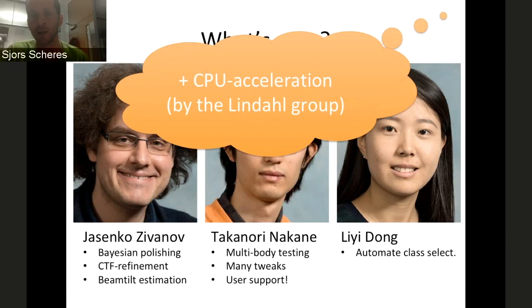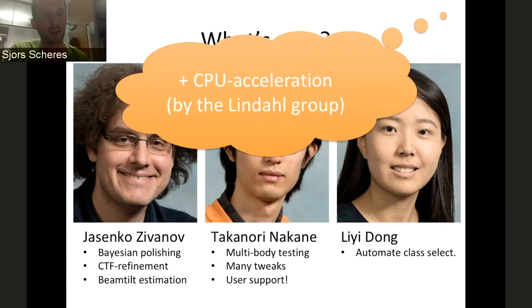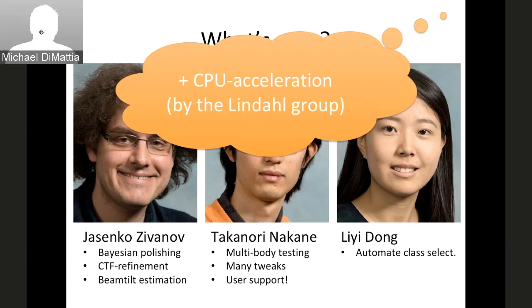So now Relion 3 can run on multi-core CPU clusters much faster than before, about 5 to 10 times faster, and thereby its cost efficiency is, I think, similar to the professional double precision NVIDIA cards. Whereas I think single precision gaming type cards are still a lot cheaper than running on the CPU.